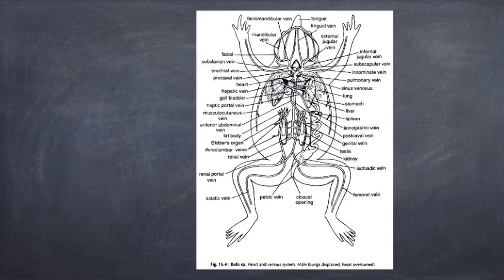Next is the large intestine. It is a straight, club-shaped, usually dark-colored tube. It is continuous with the small intestine. Its ending is at the anus. The next part will be the urinary bladder. It is a membrane-like bilobed sac, ventral to the posterior end of the large intestine.